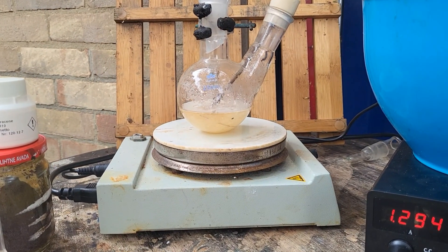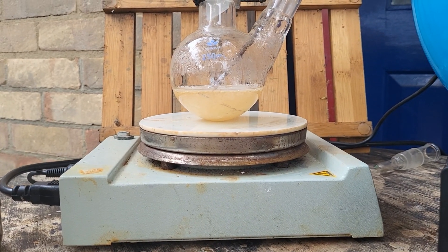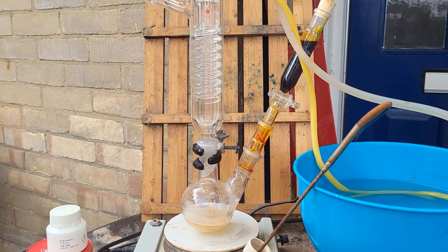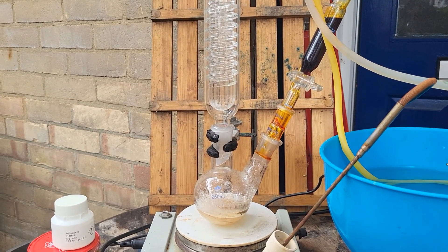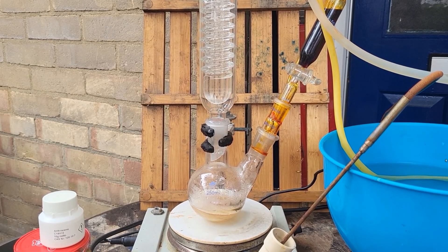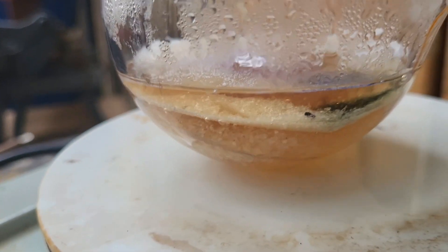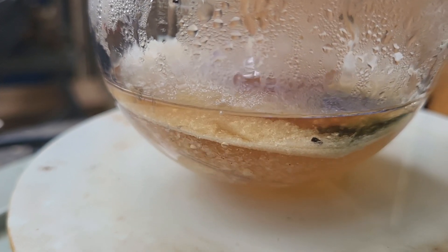Since this anthracene doesn't want to dissolve, I'm going to proceed with the next step. I will begin adding the chromic acid in acetic acid to the anthracene in acetic acid. Heating is not required as the reaction will proceed with reflux because it's exothermic. You can see some chromic acid got in there and it's oxidizing the anthracene.